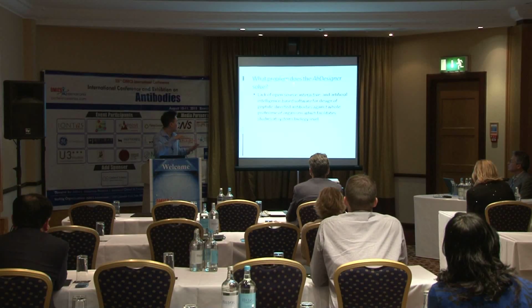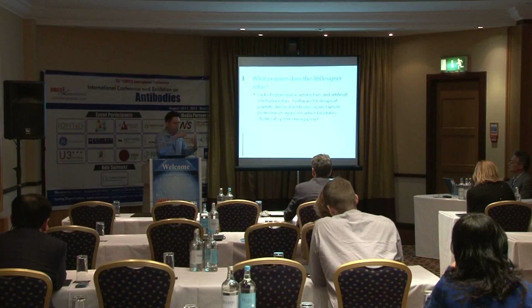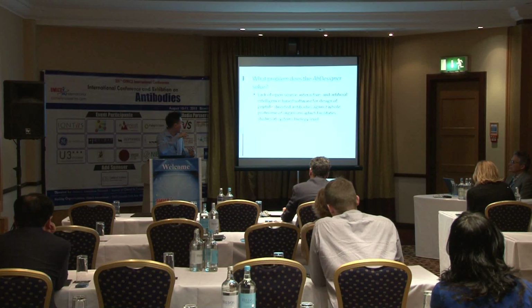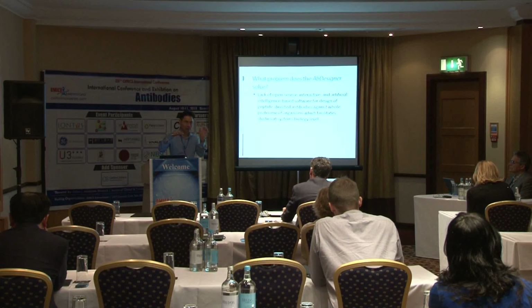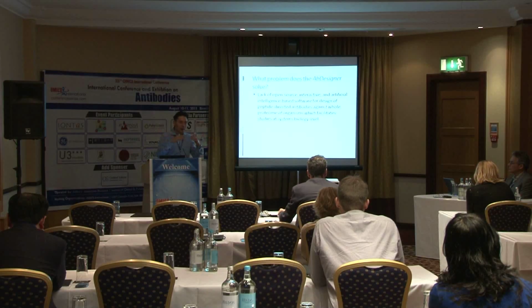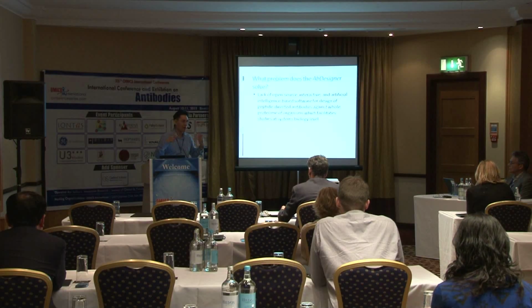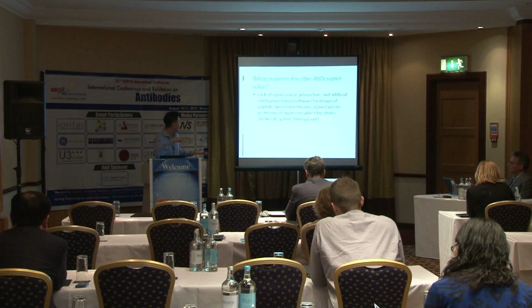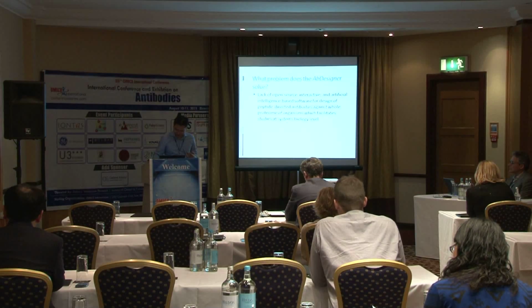So we built this one, and we call it an integrated tool. It's interactive, open source, and it has some artificial intelligence base to help you design or pick the peptide epitope. So we can now start thinking about making antibody to the whole proteome, and make it faster to facilitate this process. That's the goal of our work.